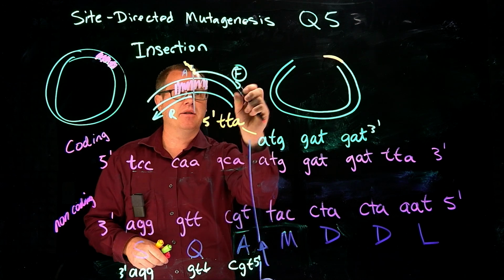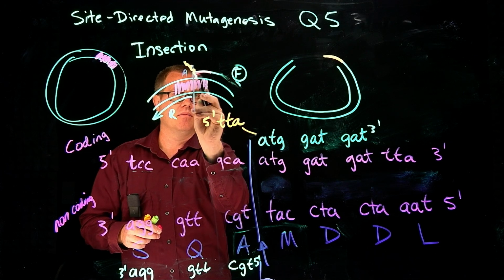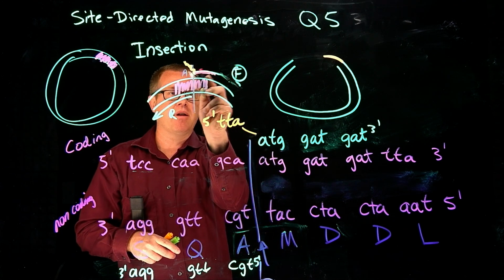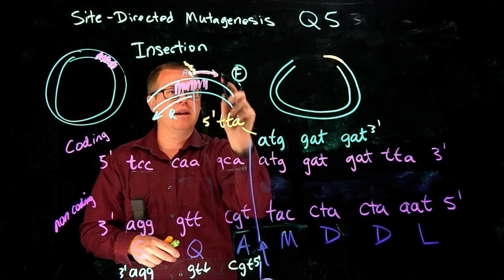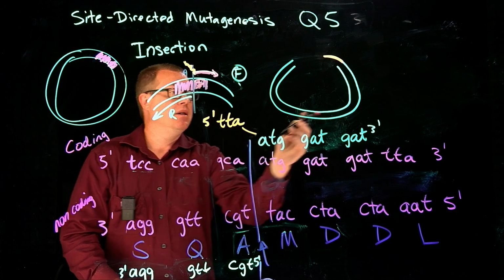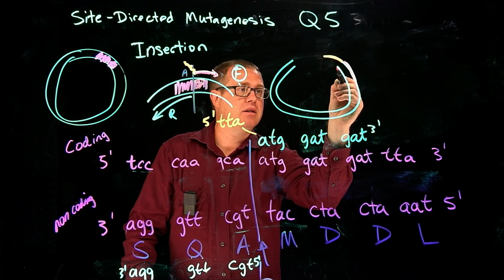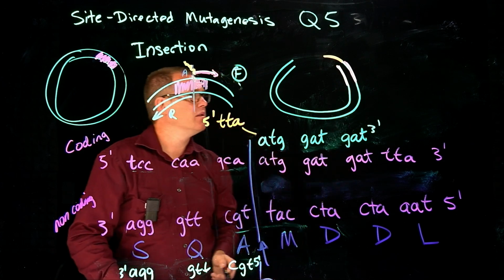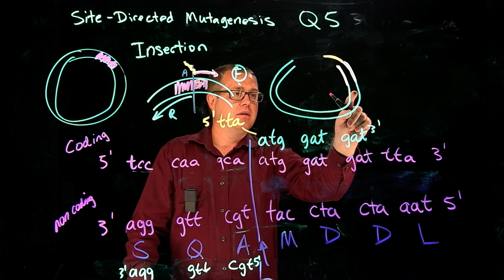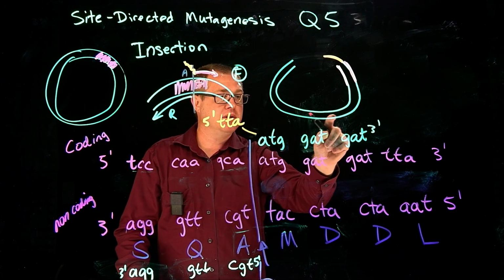So in theory, we could say this whole forward primer is just pink because it's going to match the pink DNA. And so this little pink primer right here, the forward primer, now that I'm drawing it in pink, is going to anneal to the gene. And so there we have it. Okay, so here's the pink part of our gene right there. And then we continue around, that's the rest of the primer, the plasmid.